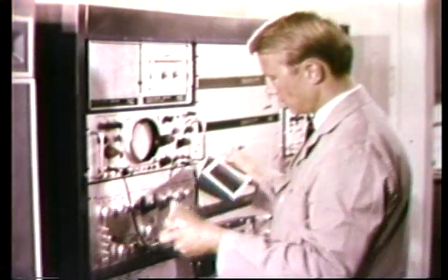Data relating to the analysis are preserved in graphical and numerical form for possible testimony in court.